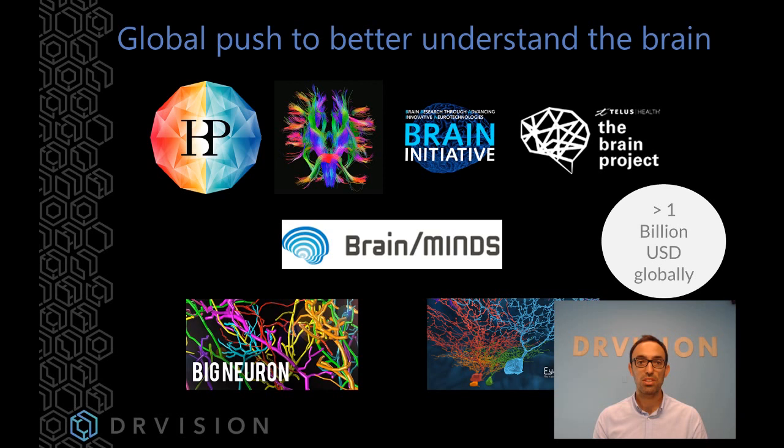And this signals an important factor: these projects are actually trying to develop, in most cases, new tools and new workflows for handling this data. And on the part that touches our software, Aivia, the key bit that touches our software is our tools related to mapping neuron morphology and tracing neurons.